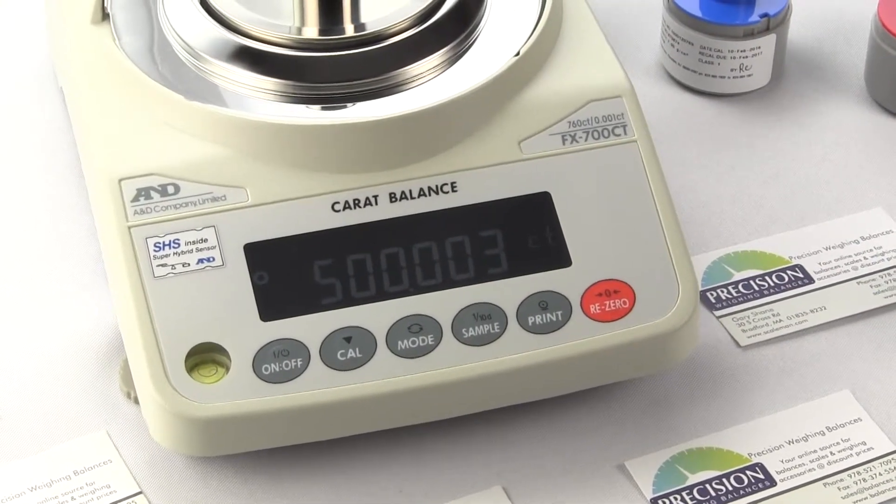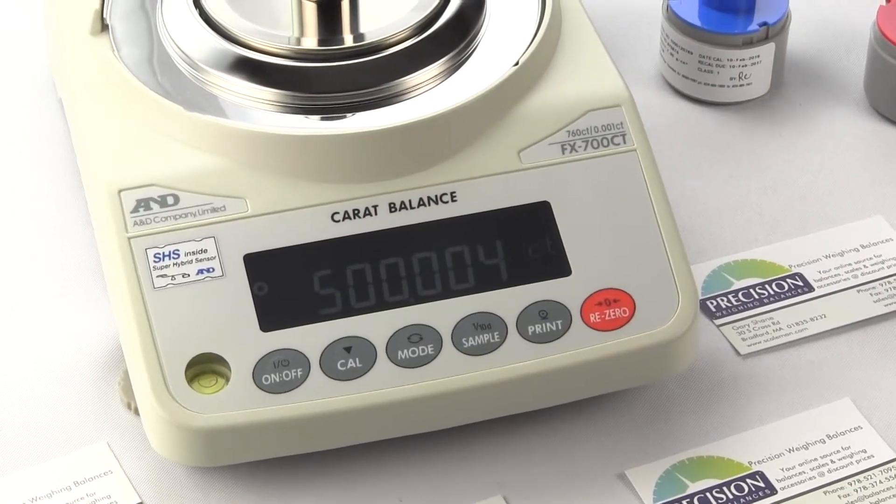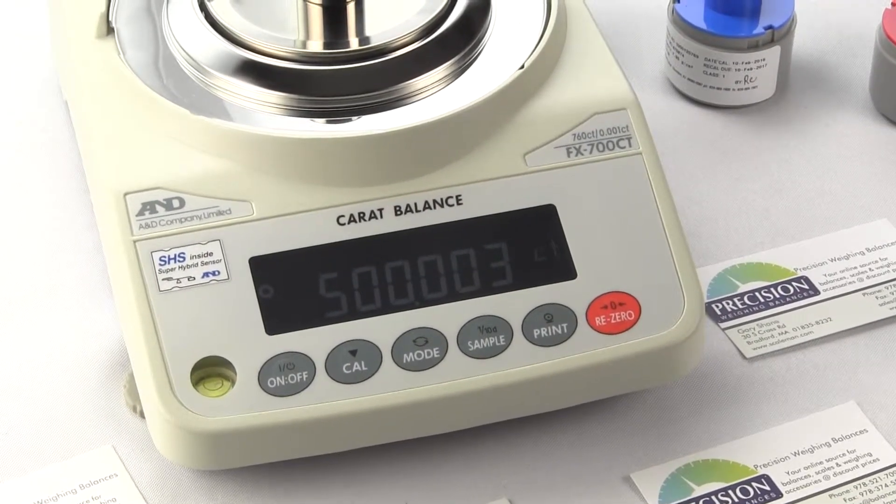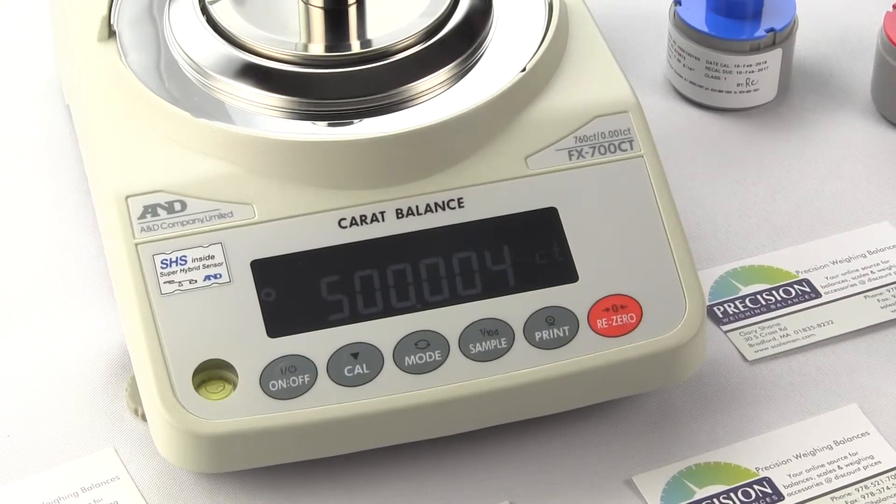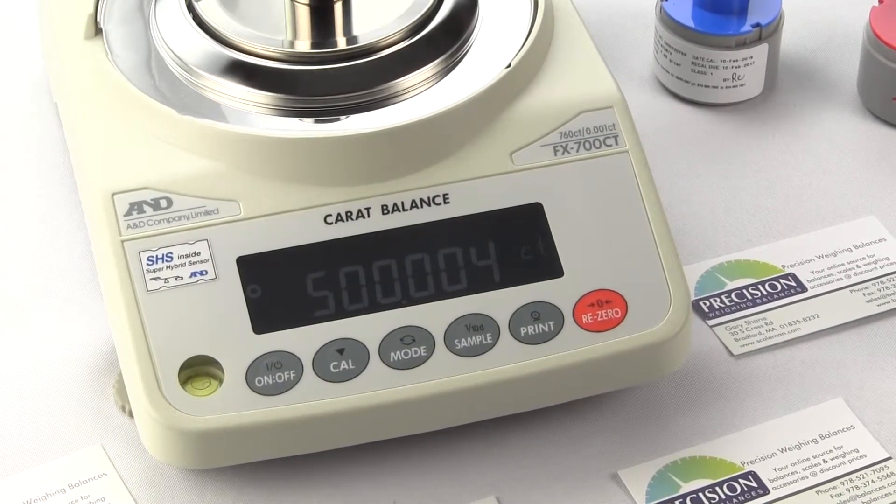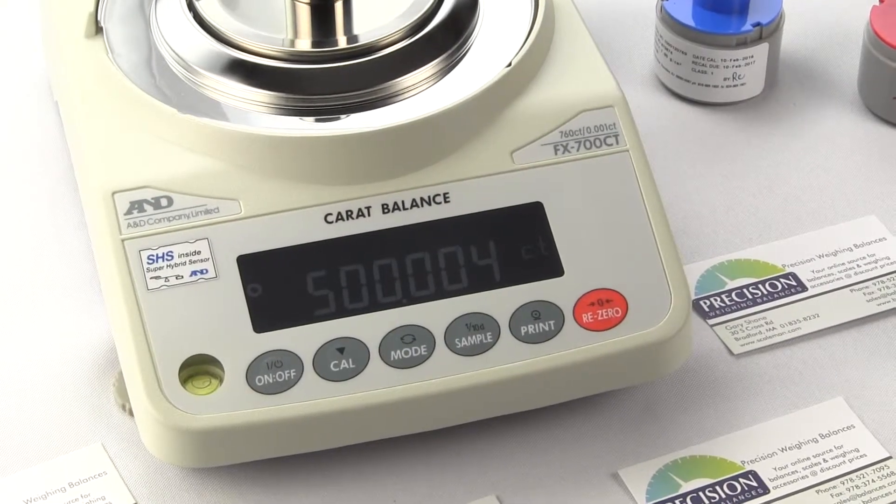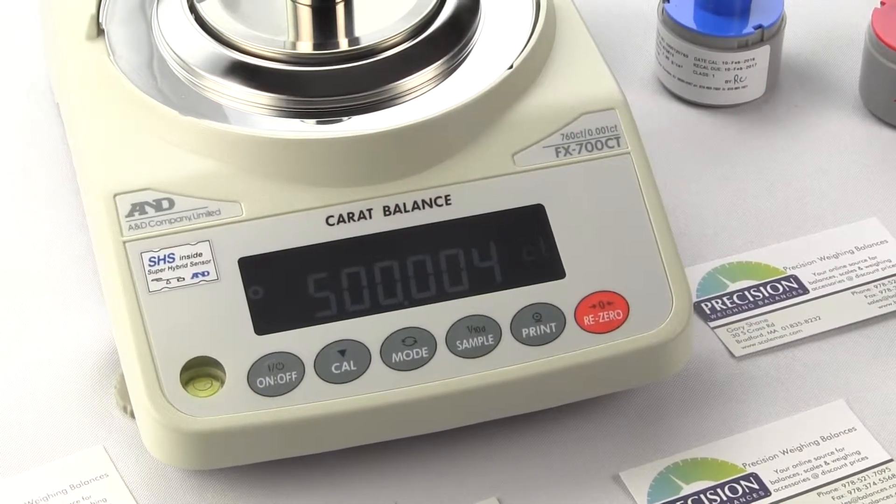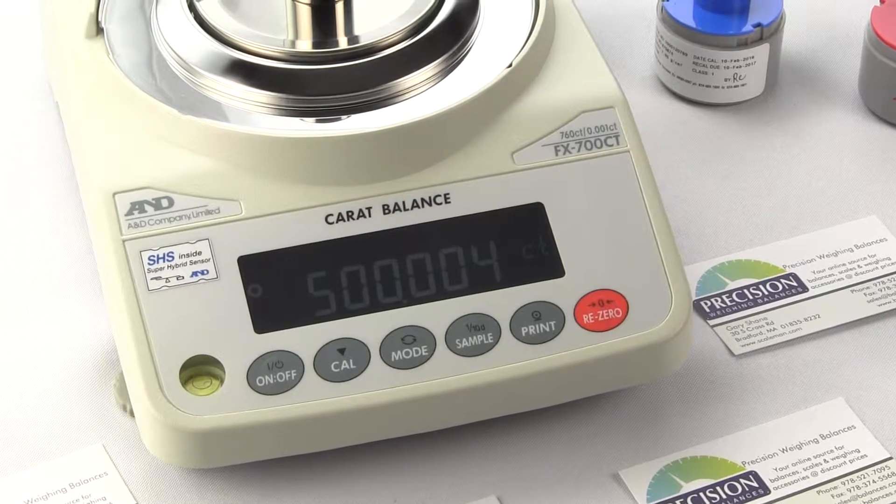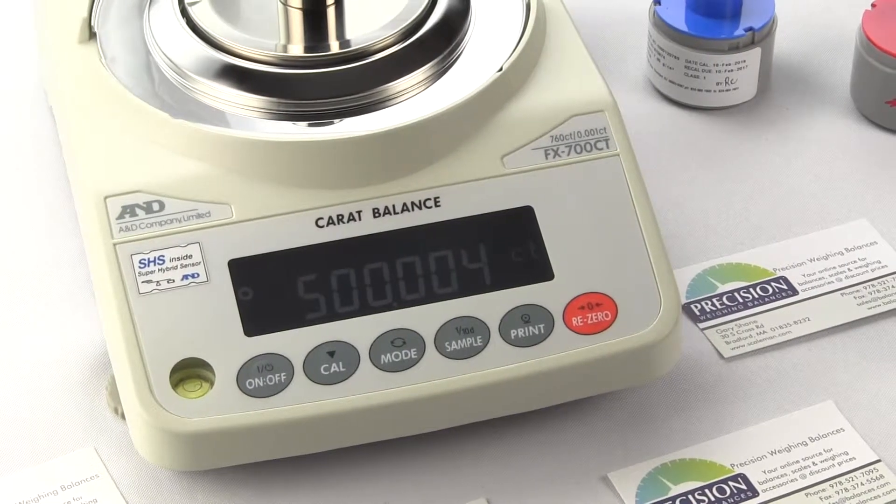The FX700CT is not legal for trade so it's non-NTEP. So this carat scale would be used for more like sorting diamonds by weight or maybe appraisals versus selling diamonds. Most states require legal for trade when goods are sold by weight. We offer several Mettler Toledo balances that are legal for trade but they'll cost a lot more money than the FX700CT. States like New York, Arizona, California and Florida have very strict legal for trade rules. This is an affordable price balance that makes a great carat scale for any jeweler, hobbyist or gem collector.